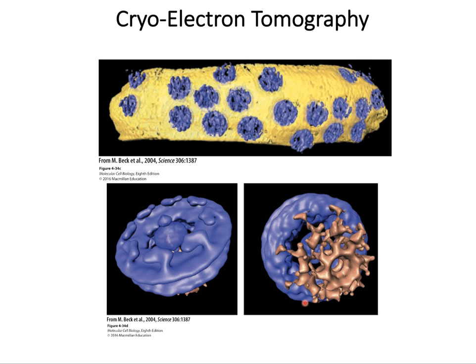You are familiar with the term CT scan or CAT scan in medical imaging. It stands for computed tomography or computer-assisted tomography, which gives a 3D image of the tissue in a patient's body by scanning tissues in different planes, from which a 3D image is formed. In the same way, the cryo-EM images are collected by varying the stage angle a little, as mentioned earlier, and from that, a 3D image or tomographic image is formed, as shown above.